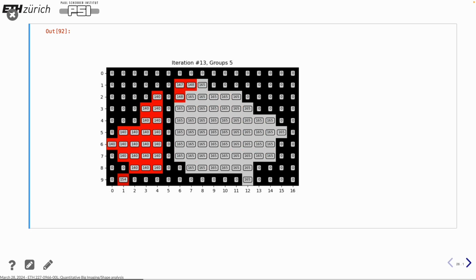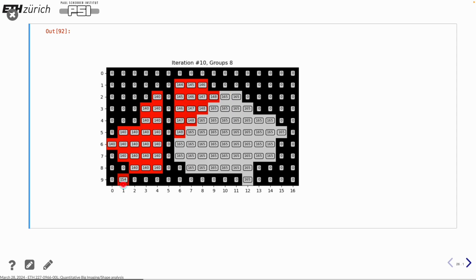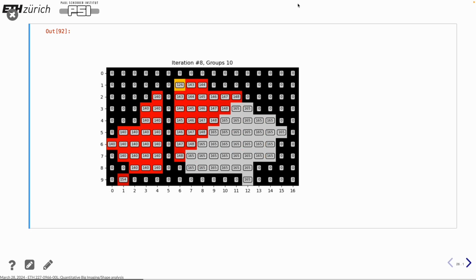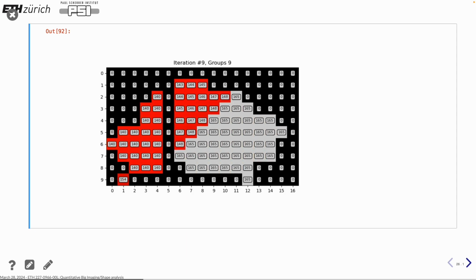And the interesting thing is, now look at this one, you can see that this has a different index or a different label than that block. The reason for that is that the cross can't bridge the gap to this free hanging little pixel. So in this case, we get 3 labels instead of the 2 that we got with 3 by 3.